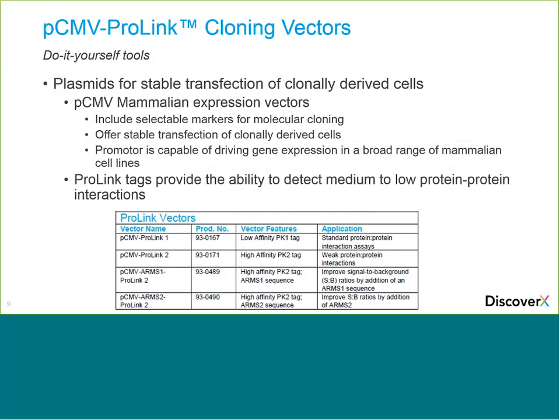So for cell lines, these are a homogeneous cell population, very stable, consistent, and robust. Definitely want to use this for your screening and quantitative studies, but it does take considerably longer to generate cell lines. As you can see in the clonal selection steps in the workflow, it's up to 6 weeks.